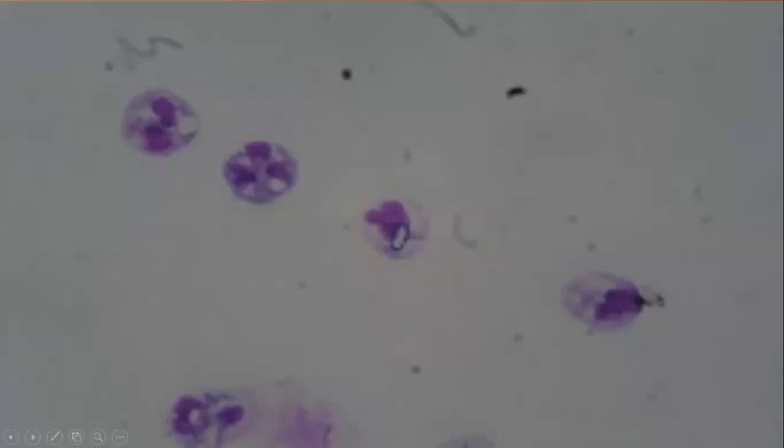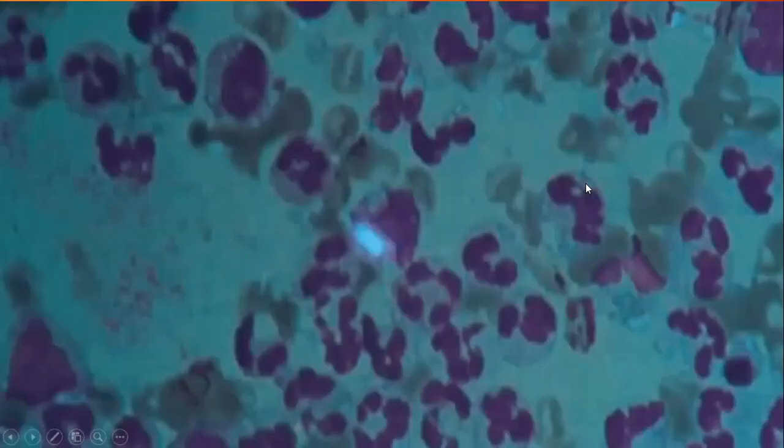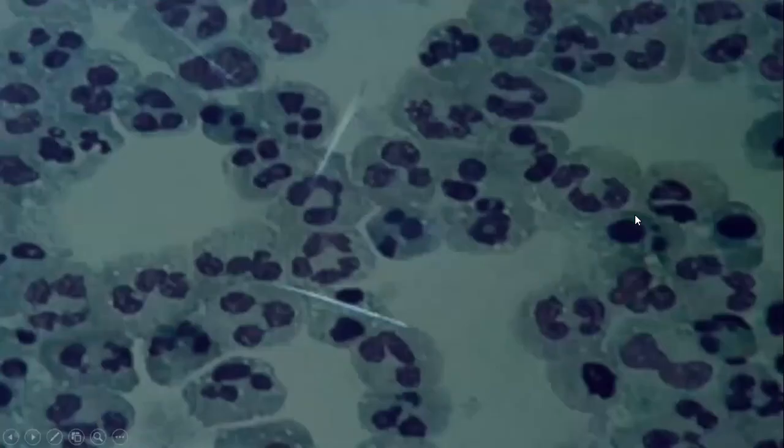This is another neutrophil with CPPD crystal inside, and more neutrophils with CPPD crystals. Notice the appearance of your needle crystals, particularly characteristic of your monosodium urate crystals. And on birefringence, your uric crystals would appear as yellow.